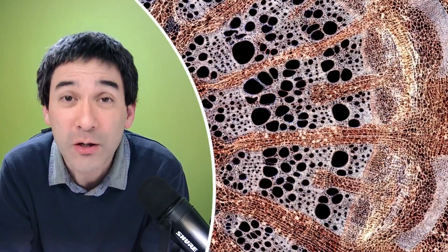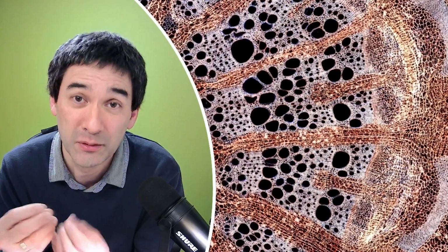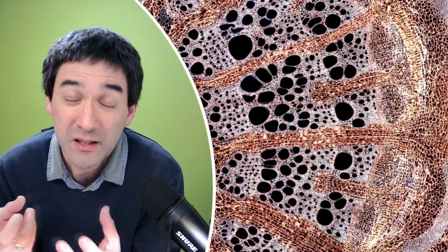And for those, you could establish certain growth tests, or you could narrow down what bacteria they were simply by observing the colony on a petri dish, how they look, and whether they were able to break down, let's say, blood agar. Is the bacterium able to produce an enzyme that breaks apart the red blood cells, for example?